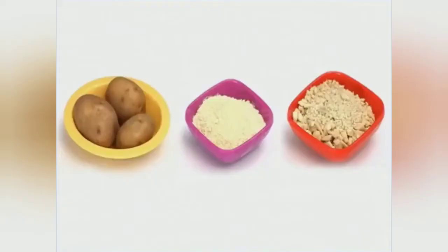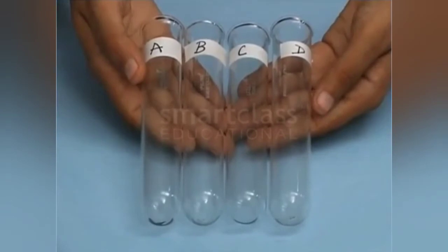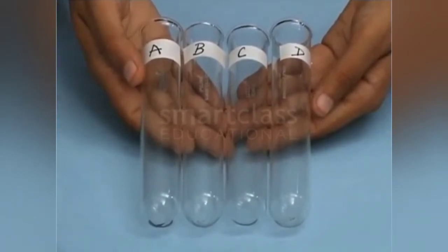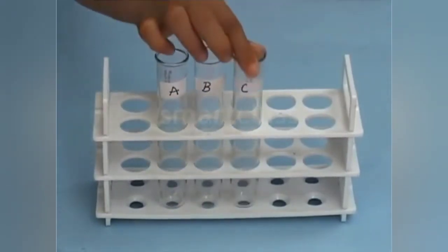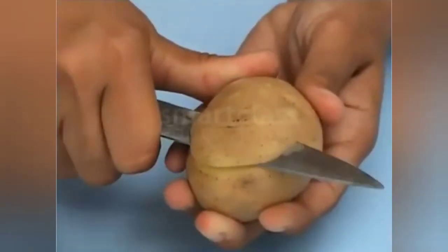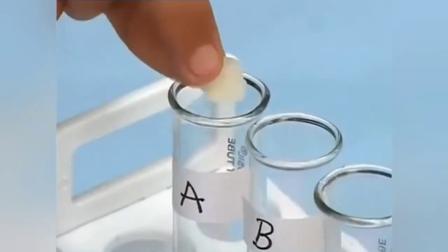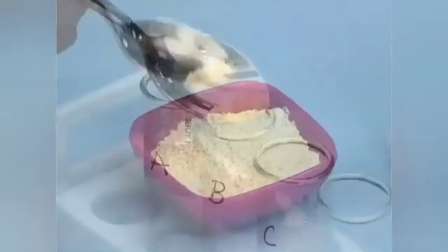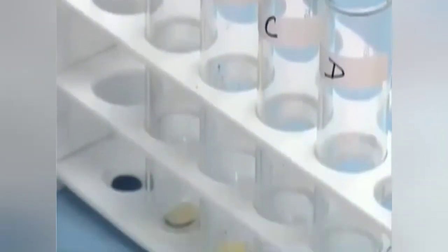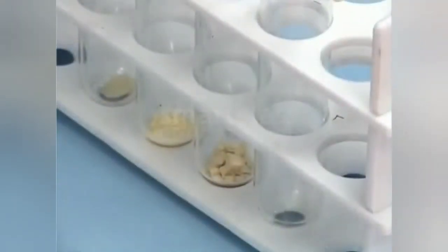Let us first test the food items for the presence of starch. Take 4 test tubes. Now mark them as A, B, C and D and place them in a test tube stand. Cut a small piece of potato with the knife and put it in the test tube A. Take a little quantity of powdered pulse and put it in the test tube B. In the test tube C, add a few pieces of crushed cashew nuts.